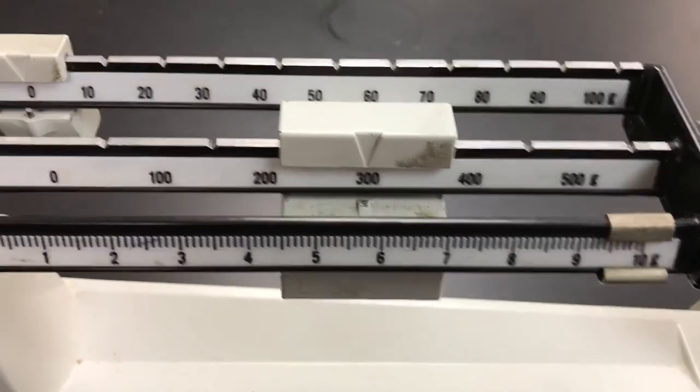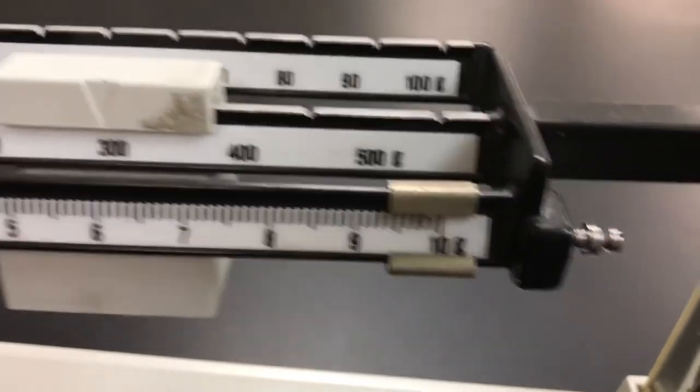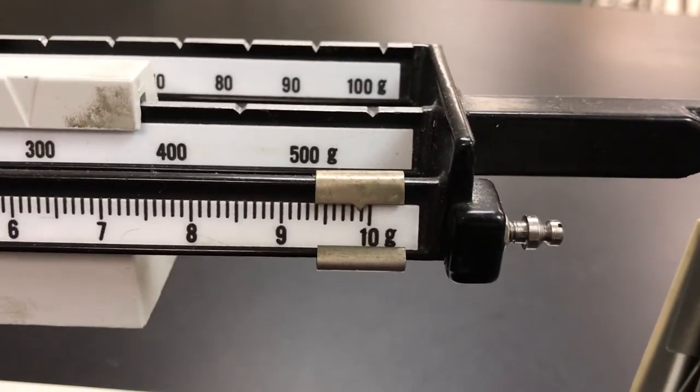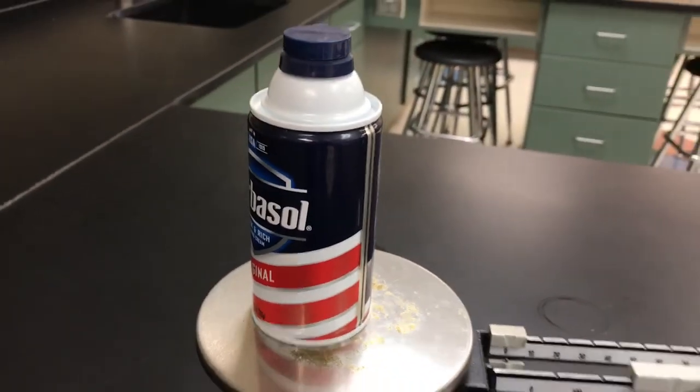To find the mass of the object, you just add your weights up. I've got 300, plus zero on the tens, plus 9.9 grams — so 309.9 grams for that can of Barbasol. You're gonna get a lot of practice on Monday and into next week; we'll be measuring mass, volume, and length using metric rulers. Have a great weekend — no homework! Just explore and be ready to go. See ya!